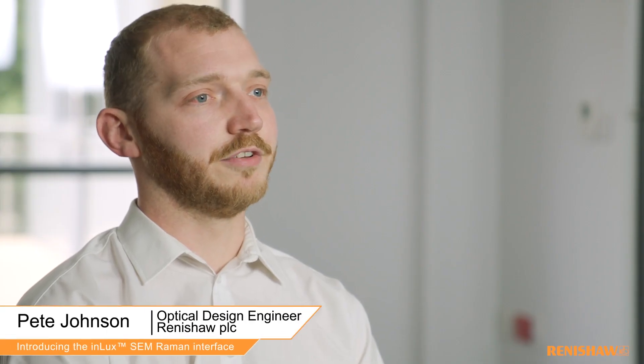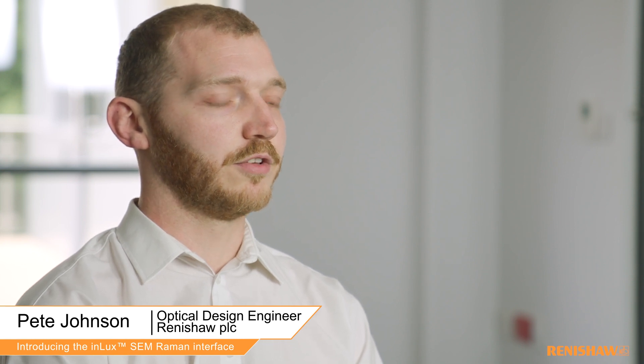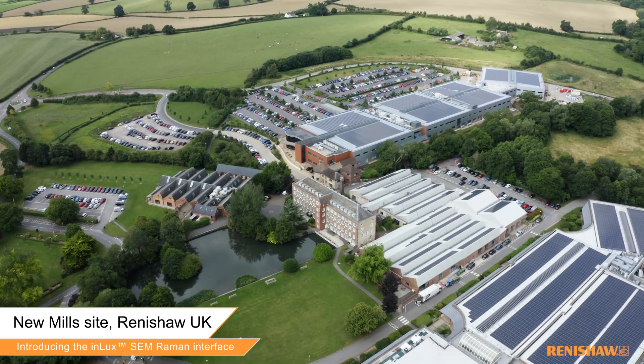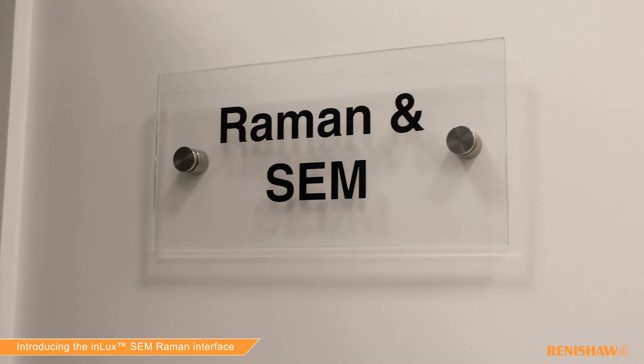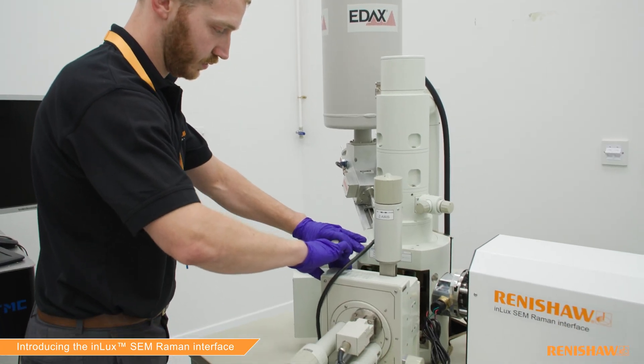InLux is our new SEM Raman interface that allows you to bring the benefits of Raman spectroscopy — structural and chemical analysis — to the inside of a scanning electron microscope. It's useful because it allows complete co-localization of the SEM and the Raman data, which has previously not really been possible.